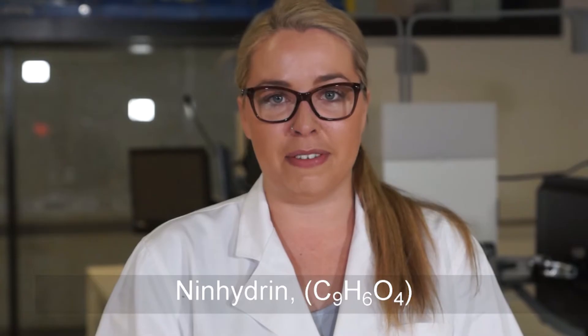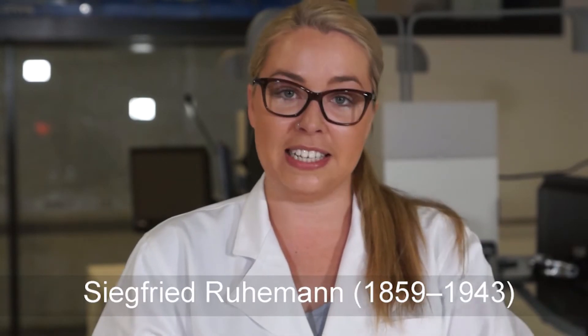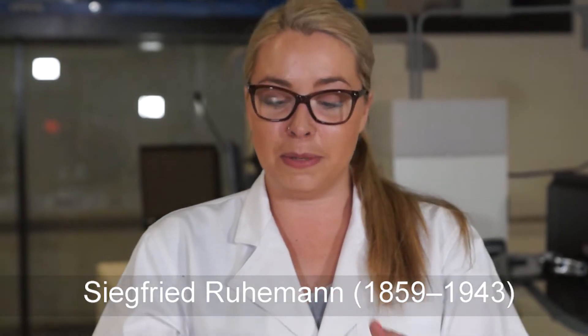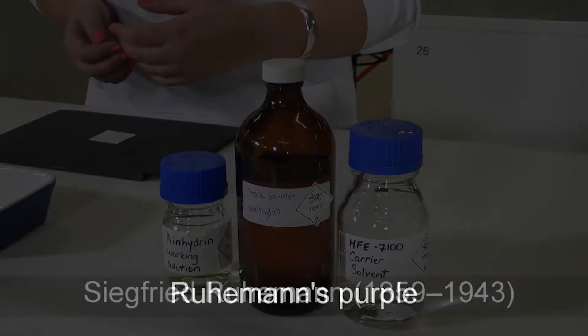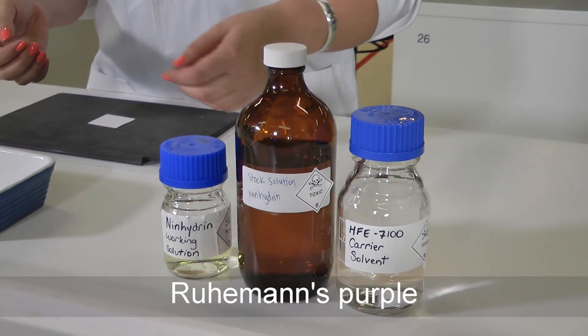Ninhydrin was discovered by Siegfried Ruhmann. What he found is that when people touched this compound their fingers actually turned purple. This purple colour was later characterised and called Ruhmann's purple. Ninhydrin has been used by law enforcement agencies around the world to develop fingerprints on paper since 1954.